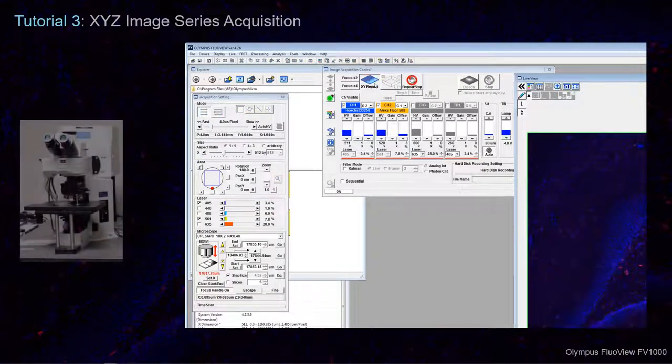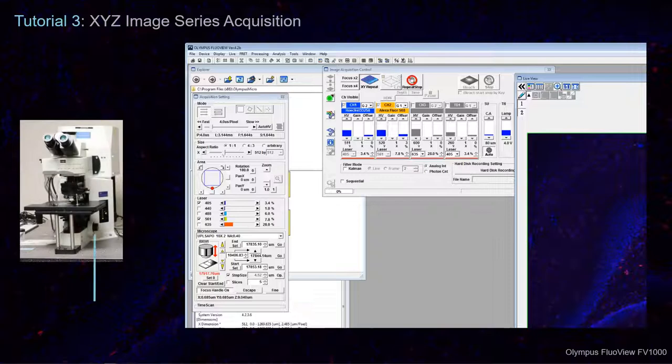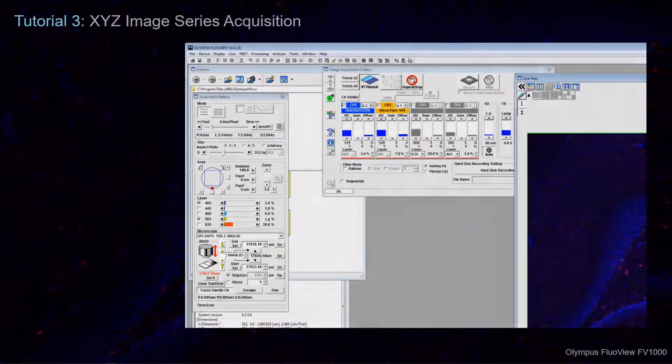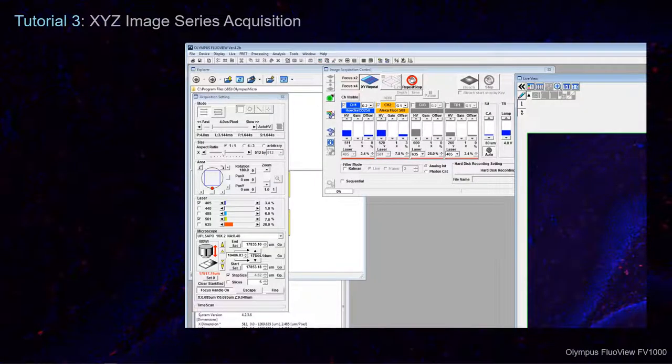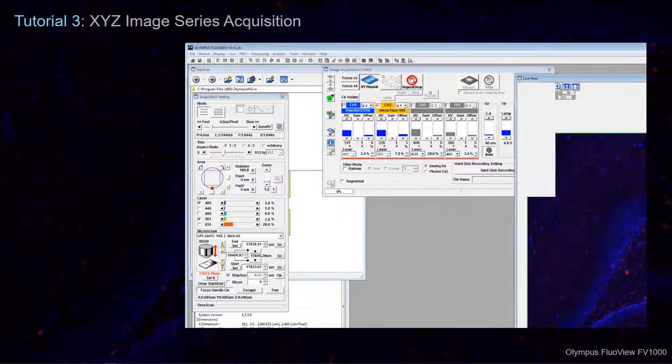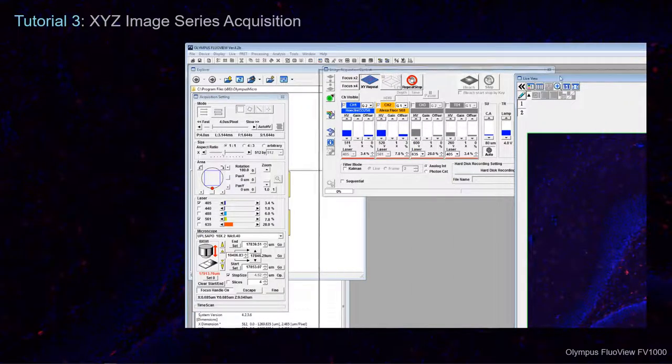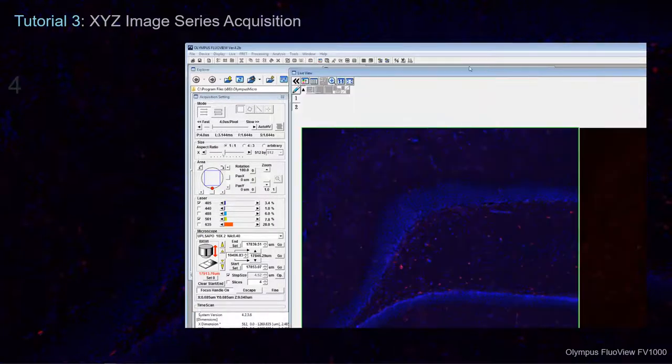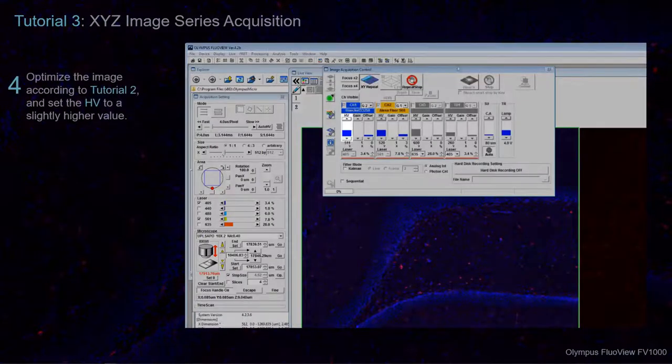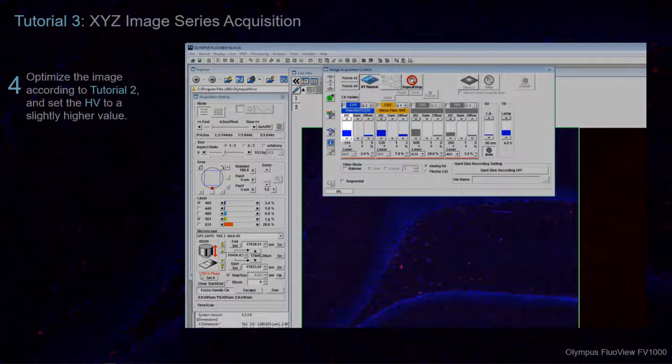Using the Microscope Focus Handle or the Z Move buttons, find the section with the brightest intensity. Follow the instructions in Tutorial 2 to open the Lookup Table. Optimize the image and then set the HV at a slightly higher value.